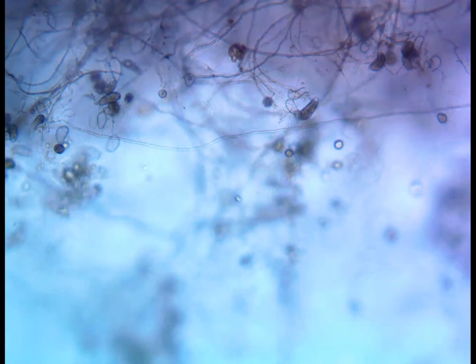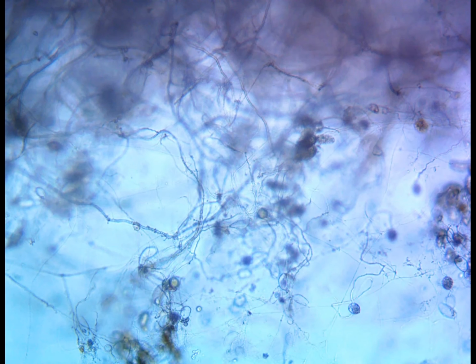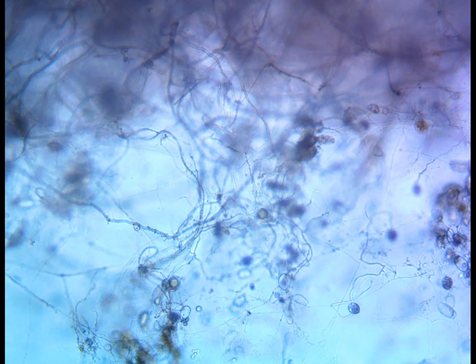Now, this particular video is being taken from a petri plate with a little less than a centimeter's worth of water depth in it. As we start right around here, we'll start focusing down from the top layer where we've been seeing all these zoospores swimming to deeper in the water column. As we go farther down, we'll see that zoospore numbers start to decrease. And as we work all the way down to the bottom where the sporangia will show up, you'll see that there's very few zoospores down there. What's going on is that zoospores swim in opposition to gravity. Basically, they swim upward, up to the top of a water column.